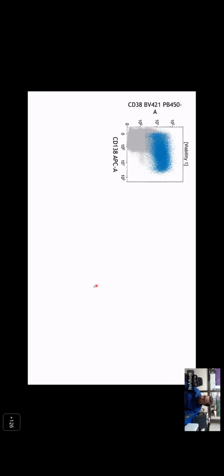Anyone of you has, let me ask Zoya or Jigisha if they know what are the immunophenotypic markers which can be used to identify plasma cells. CD38, CD138, CD56. Also, they are CD19 negative. Right. So we have used similar markers for immunophenotyping. We have used CD38 and CD138.